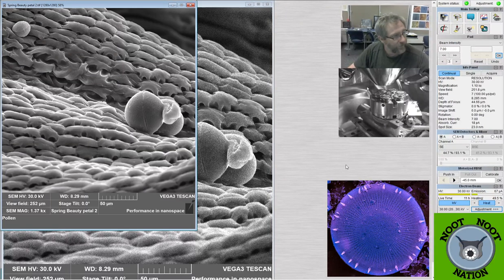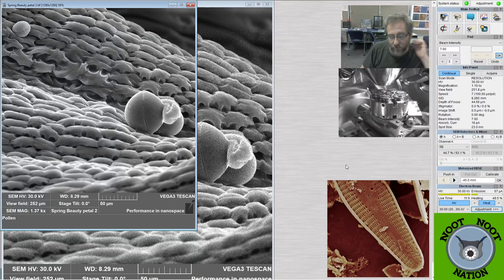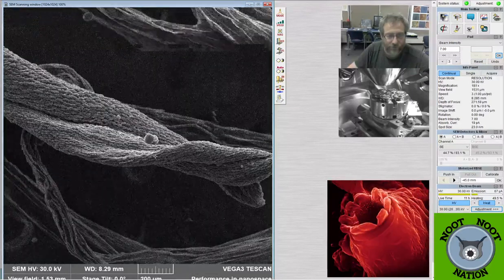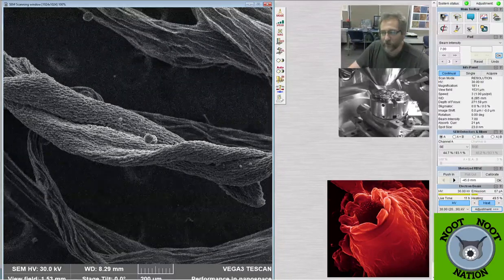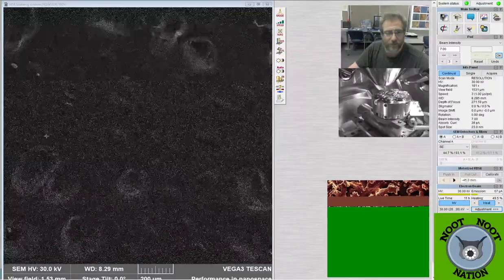And this SEM, which is a Tescan Vega 3, has a carousel that will hold 7 samples at once. So all the samples that we've looked at, I don't have to open and close the chamber and wait for it to pump down every time, which is great for streaming, and saves on a bunch of gas and other resources as well. So I'm going to hop over to number 7. Maybe let's do 6.